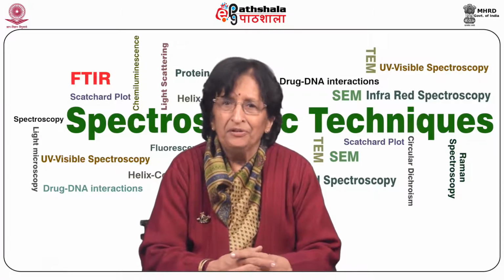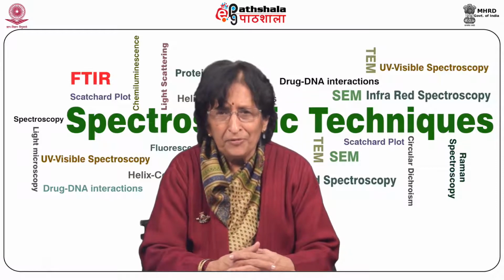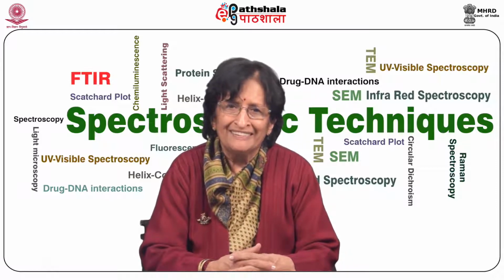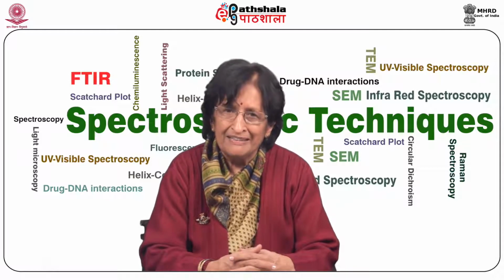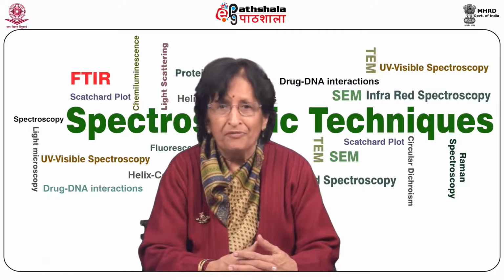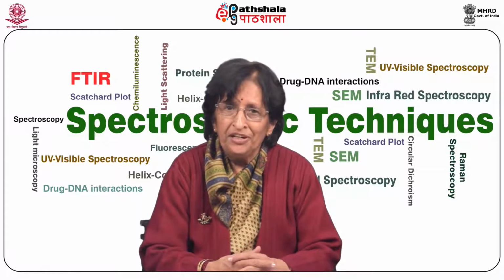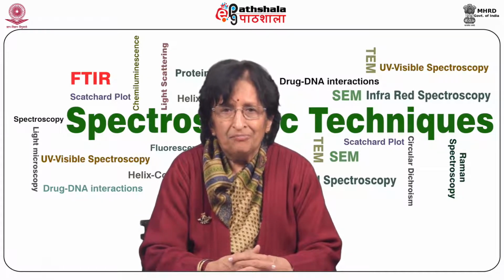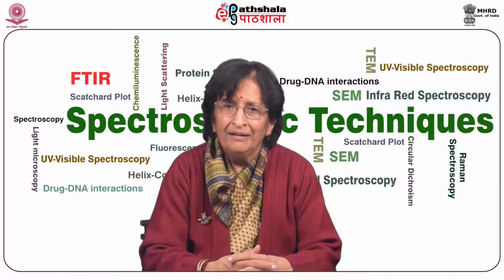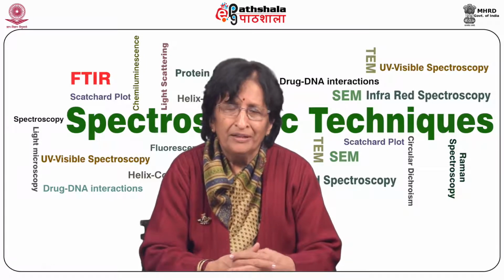Today, we are going to talk on a module, Absorption Spectroscopy of Nucleic Acids, DNA and RNA, nucleic acid bases, estimation of concentration of DNA, DNA purity, homogeneity. This belongs to the paper Techniques Used in Molecular Biophysics Part 2.